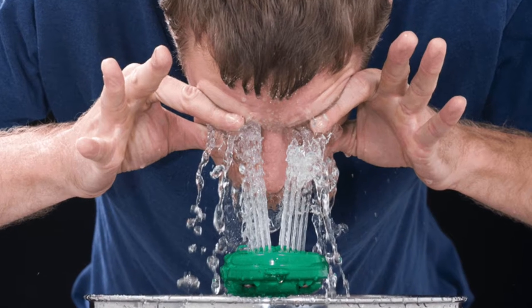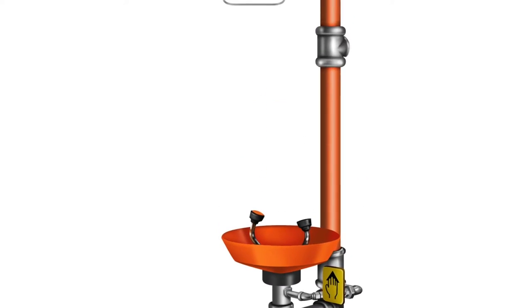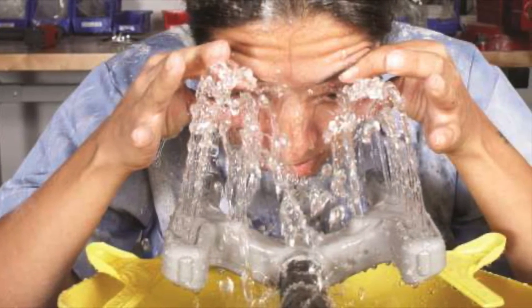You should be able to access the wash station within 10 seconds of travel and not have to go through doors or change levels. If you ever have to use an eyewash station, make sure to rinse the chemicals for at least 15 minutes.